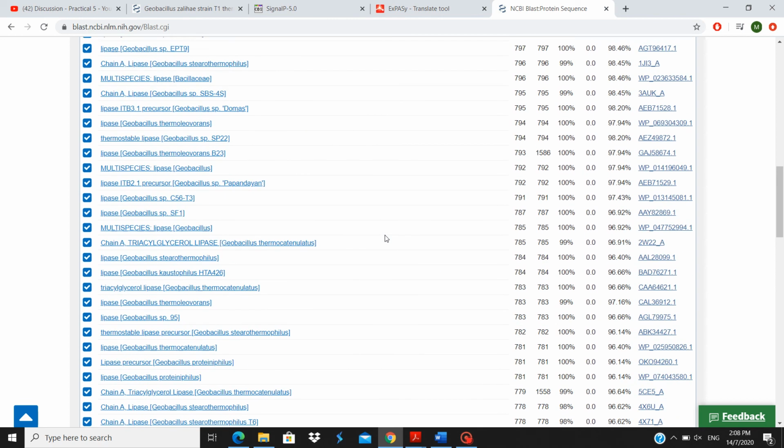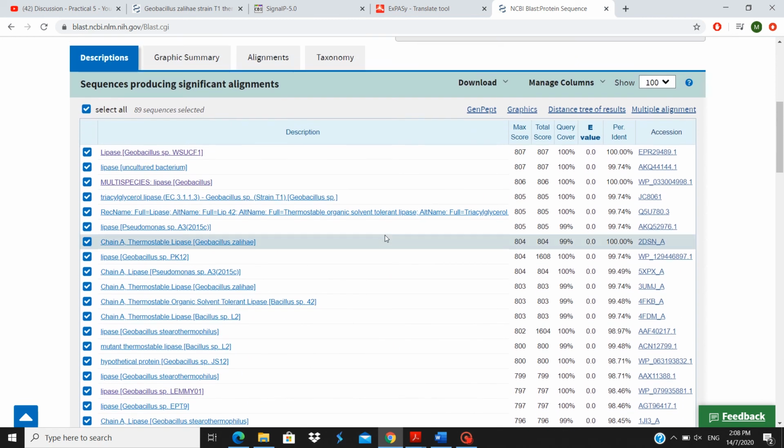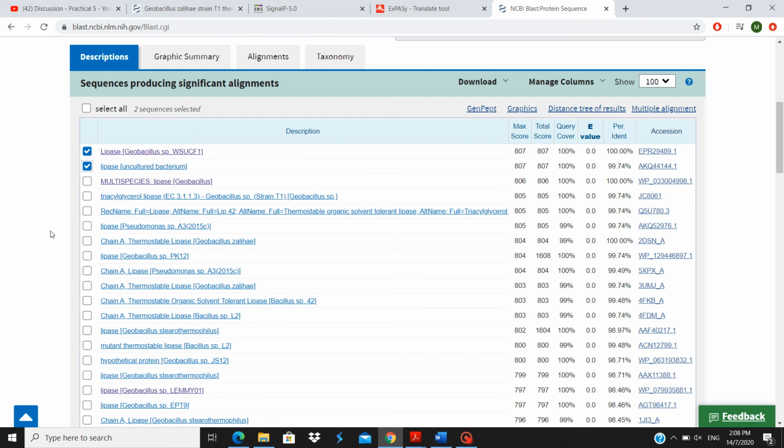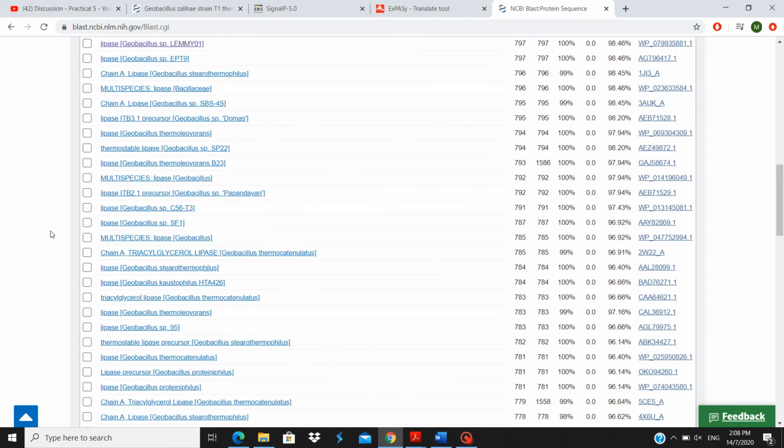When we choose, we will try to make them vary. For the first pair we choose 100 and the other one 99. This is the first pair, but we will make a little difference between them.